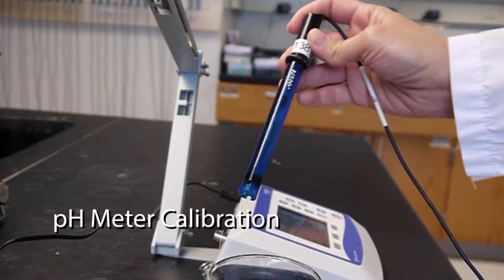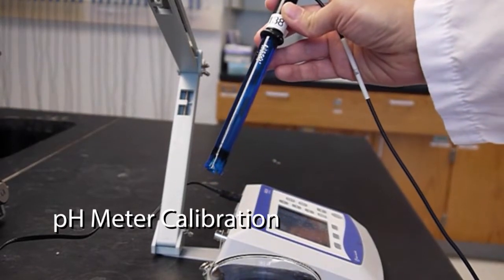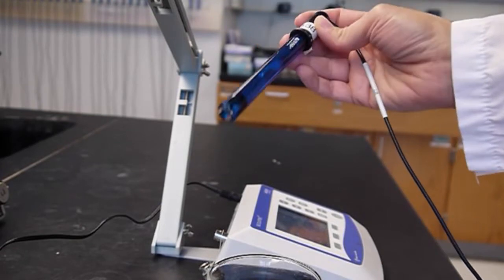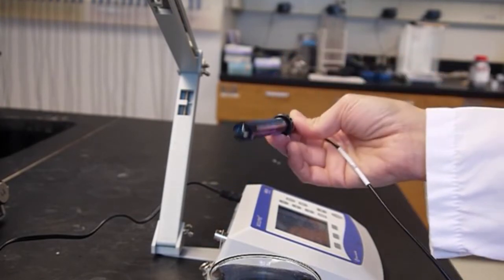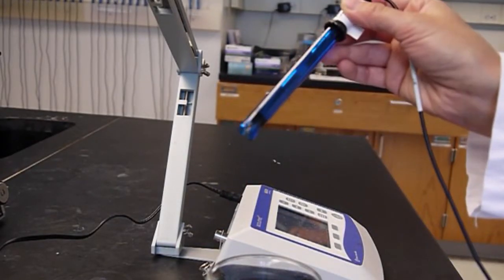A pH meter is going to use a pH electrode. The pH electrode has a glass bulb at the bottom. Be very careful with the pH electrode because this glass bulb at the bottom is very fragile.